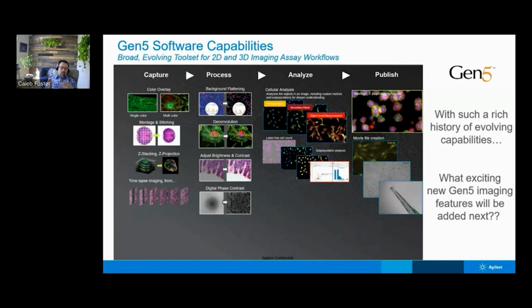And as an example, the number one application that customers continue to use across all of our imaging systems is cell counting, and it's using cell counting in a single or simple monolayer of cells.